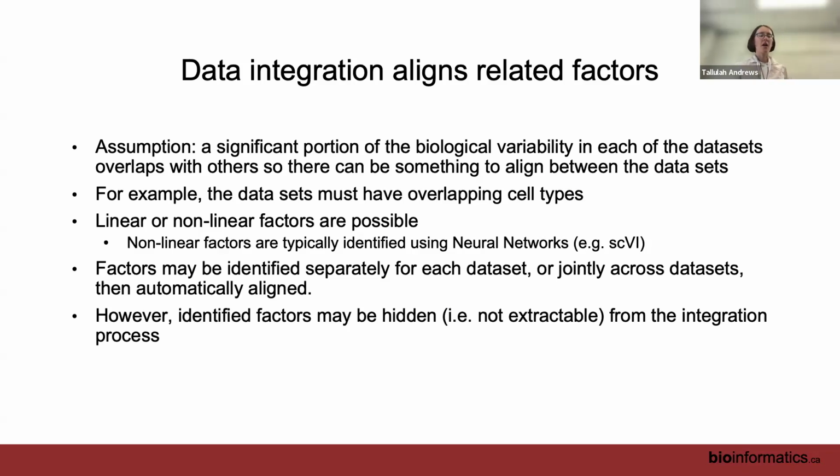The main situation here would be that the data sets must have overlapping cell types. So it makes no sense to try and integrate 2 data sets that only overlap by 1 cell type. It won't work, and it is not worth your time to try to do it. You want to have multiple cell types that overlap.